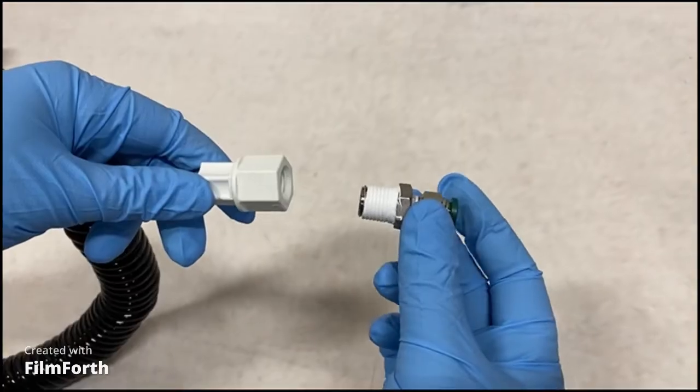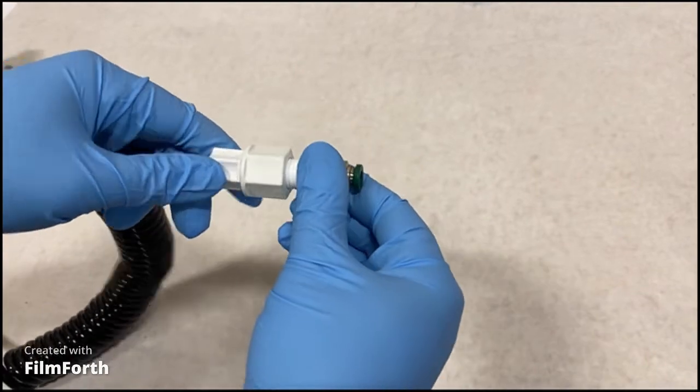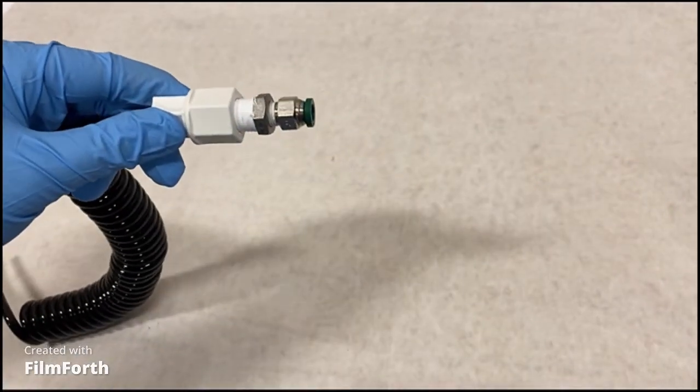The second way is to remove the black barb and connect the white nut to a quarter inch MPT thread. This is the least common connection type but may be used to connect to some pressure reducing regulators.